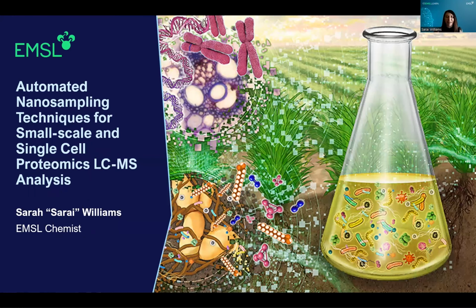Thank you, James. Hello all, I'm Sarah Williams. I'm a chemist here in EMSL, and I'm here to talk to you about some automated single cell and small scale proteomic techniques available for potential users.